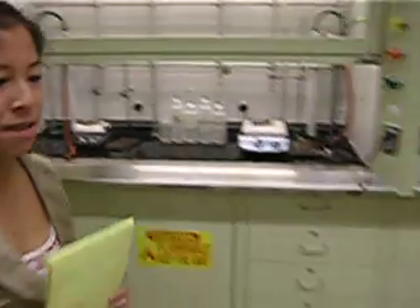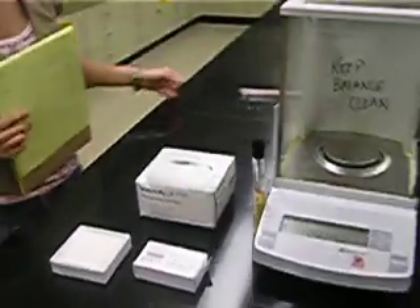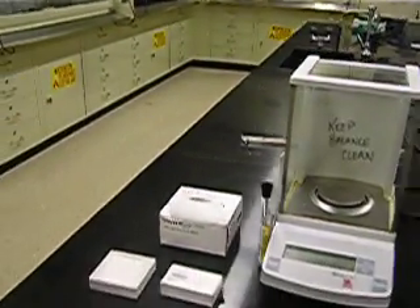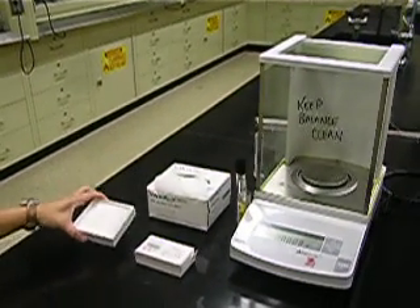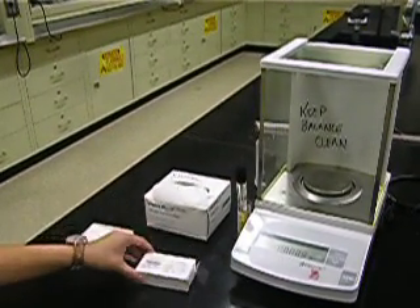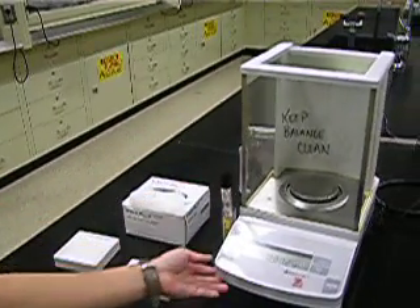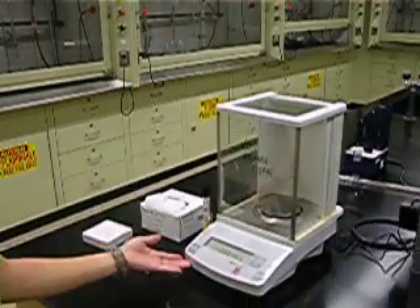Next we're going to an island which will have the melt temp apparatus and the balance. You will use the balance to weigh out your solids. You will have weigh paper, filter paper, chem wipes, a brush, and the balance. At the end of using the balance, make sure to keep it clean.